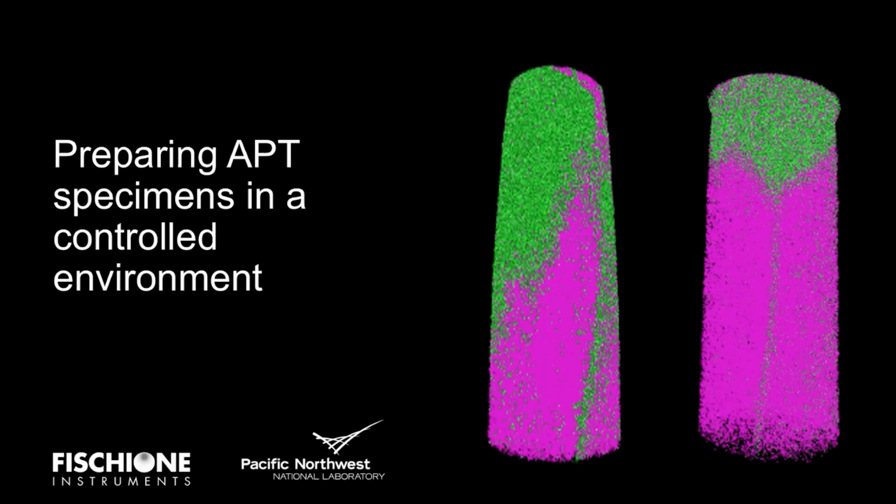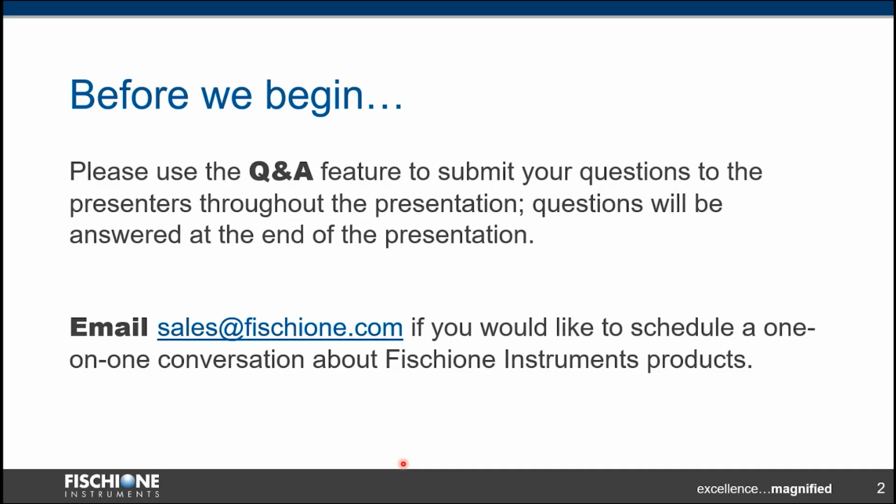We will talk today about how to accurately prepare air-sensitive samples for advanced atom probe tomography analysis. Before we start, please remember to use Q&A to submit your questions. All questions will be answered at the end of the presentation.